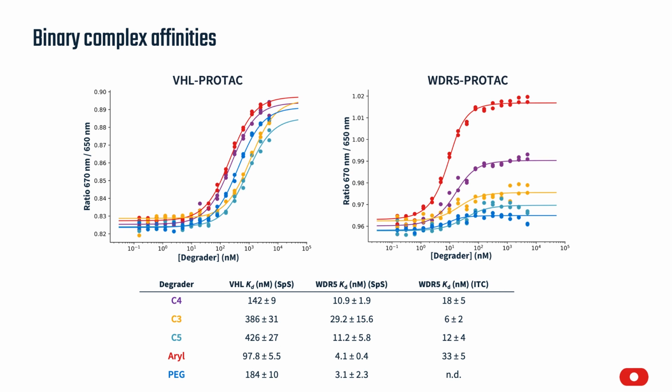And I'd like to also point out that all of these KDs measured by spectral shift, when including optimization steps all the way to protein labeling and assay development, took only a matter of days to complete, where the ITC results took weeks to optimize and measure.